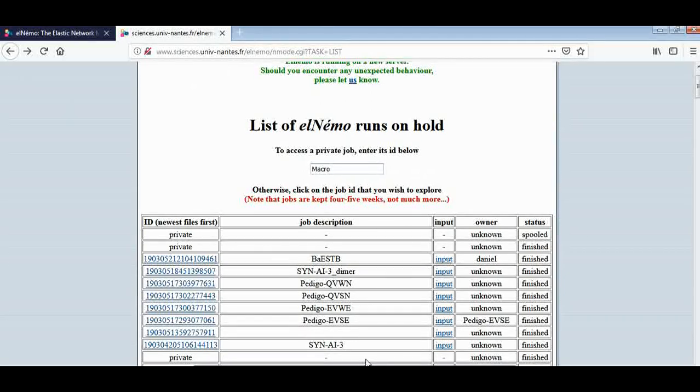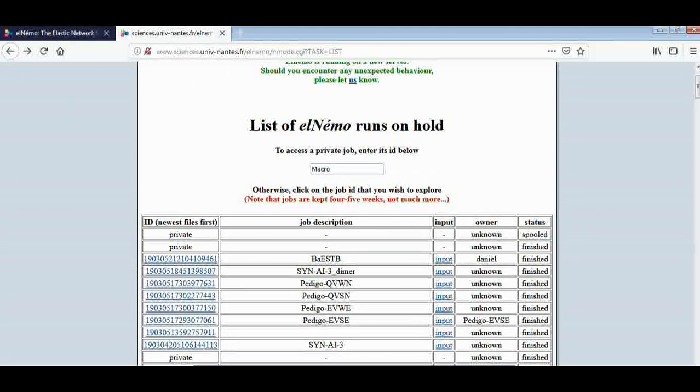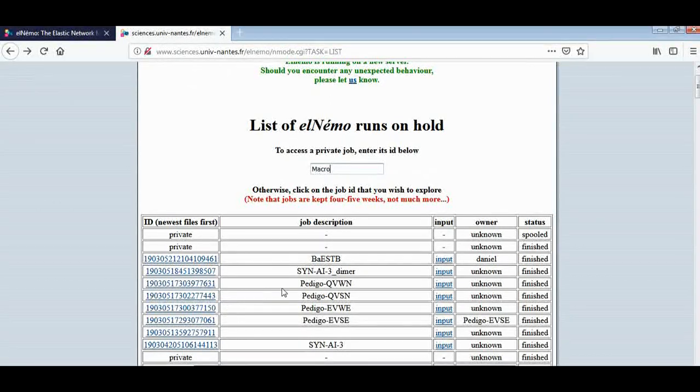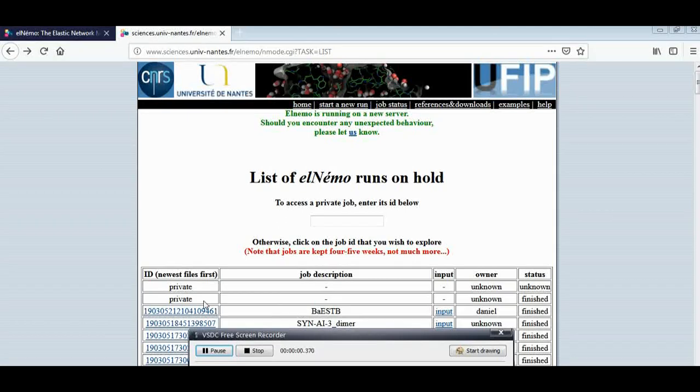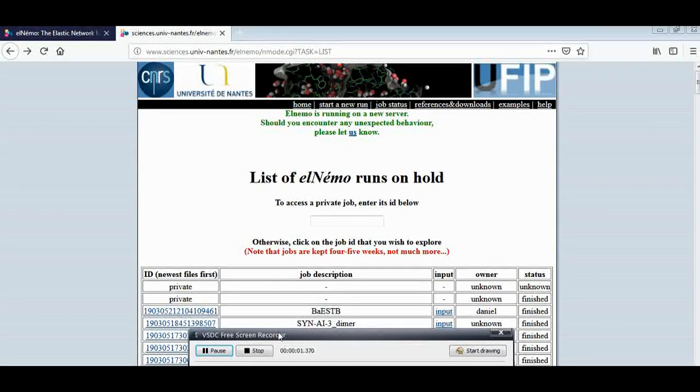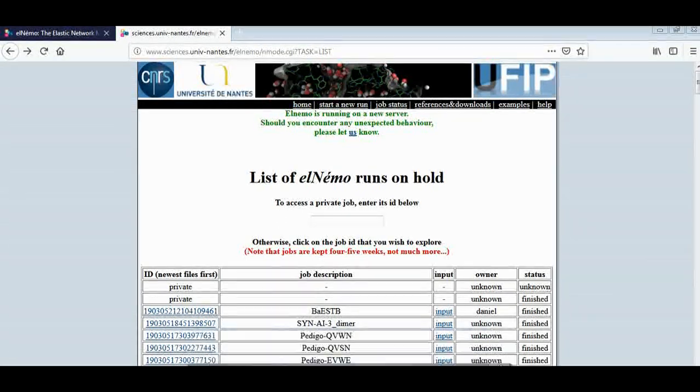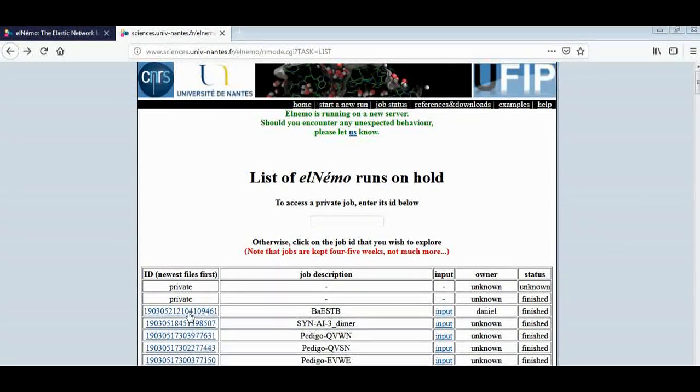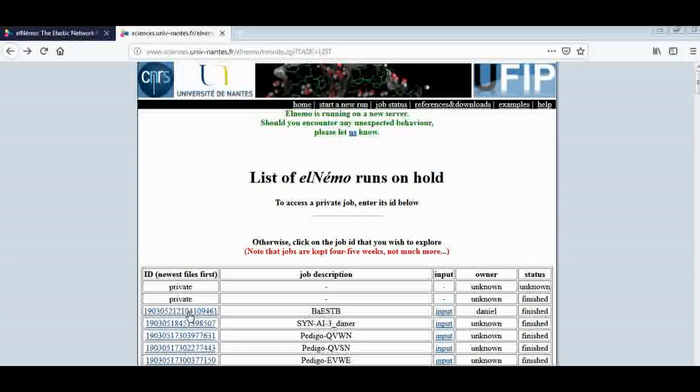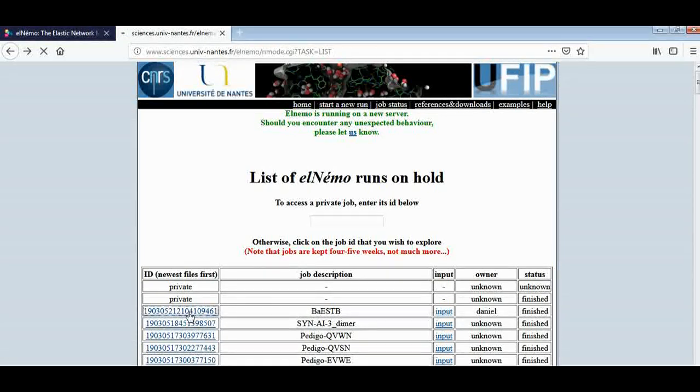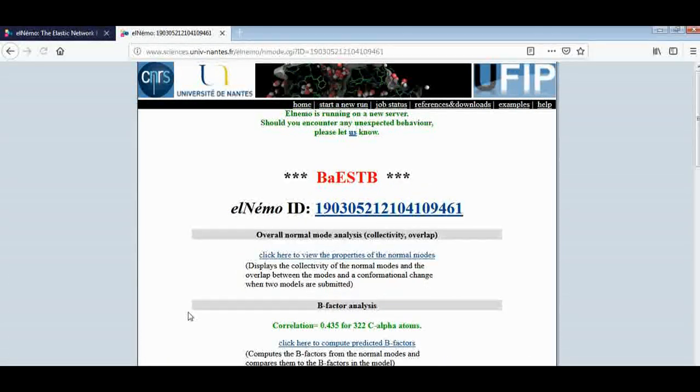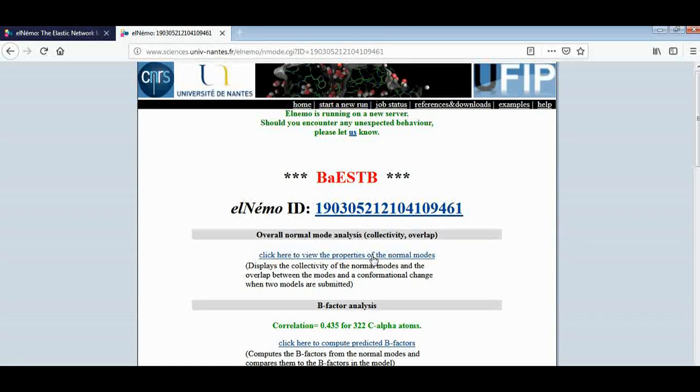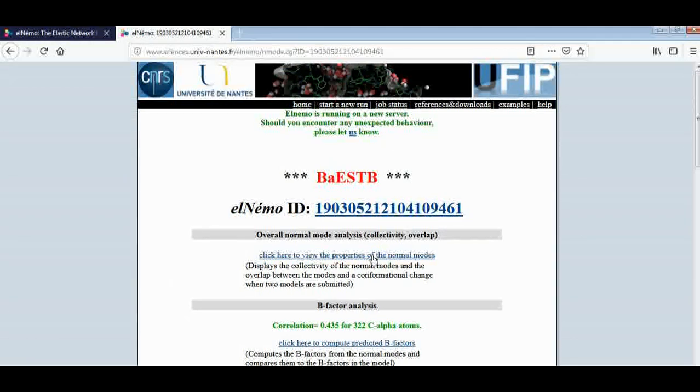Now we would like to open the job ID or the job status by clicking on this ID. Now from this we can check the properties of normal mode.